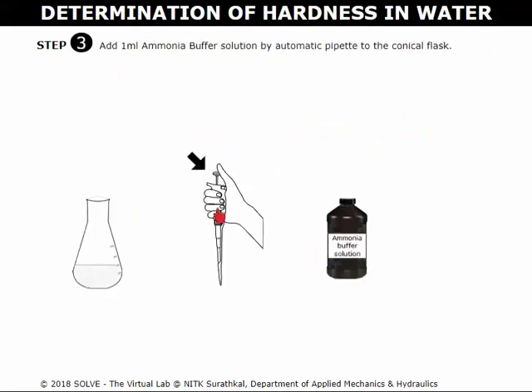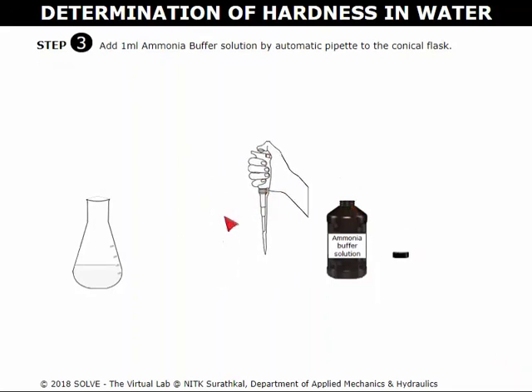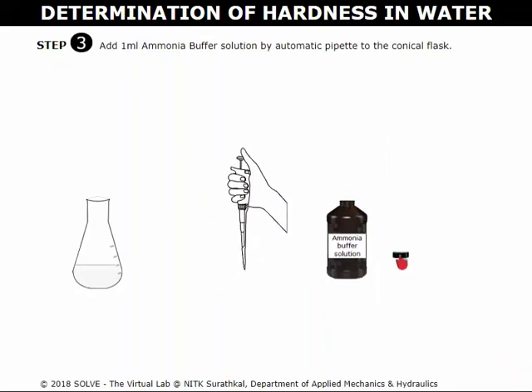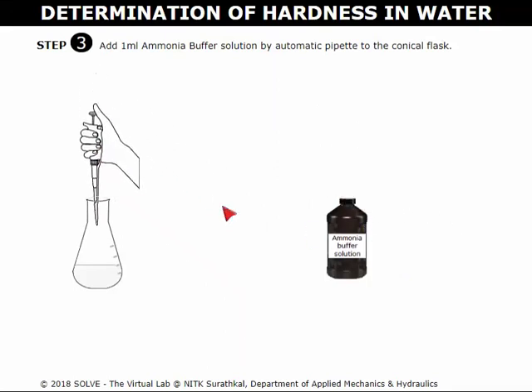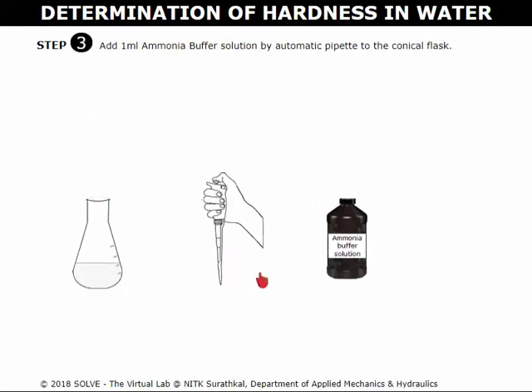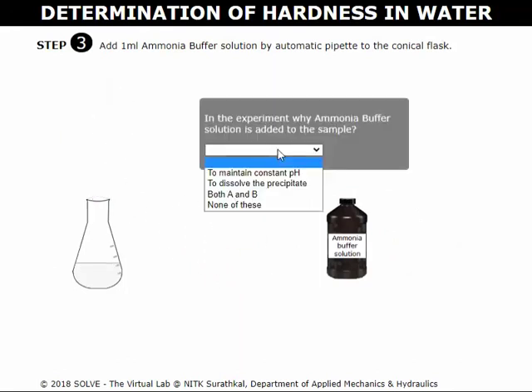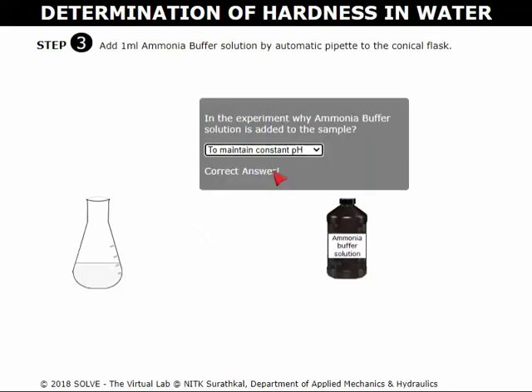Click here on the automatic pipette. Open the lid of ammonia buffer solution. Click on the pipette and pipette 1 ml of buffer solution. Close the lid. Click on the automatic pipette to release the solution into the conical flask. Select the correct answer for this pop-up question to proceed to the next step.